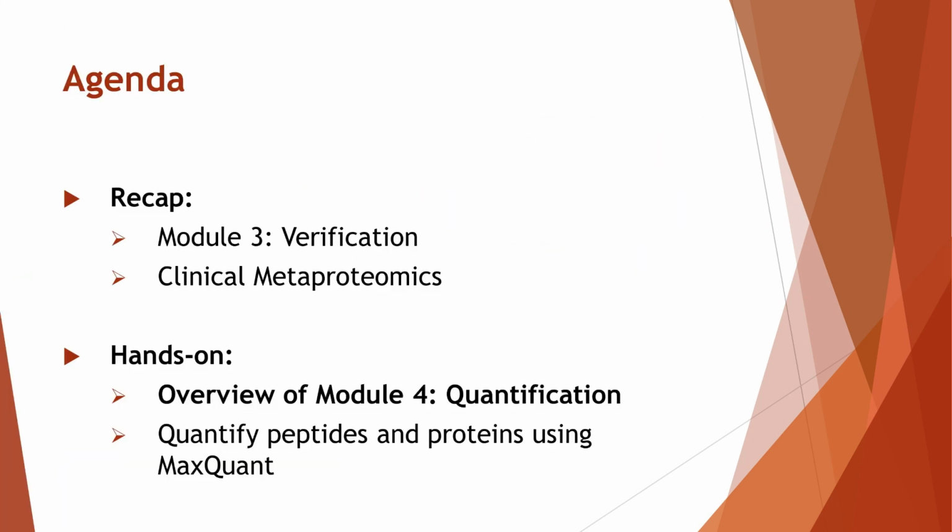Now let's begin. First, we will recap the verification module and see where that puts us in the context of the clinical metaproteomics tutorial. Then, in the hands-on section, we will execute the quantification workflow. This is the shortest module as it consists of using MaxQuant for quantification and preparing the outputs to set up for the next and final module, data interpretation.